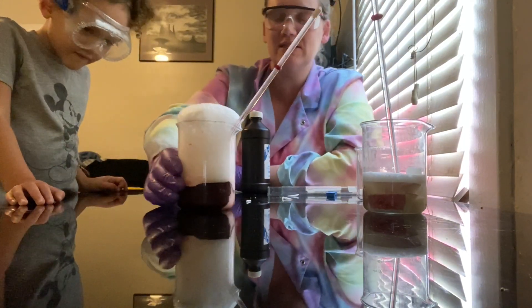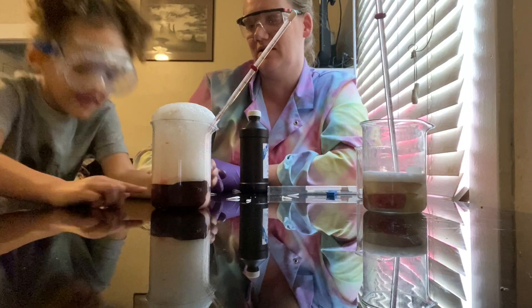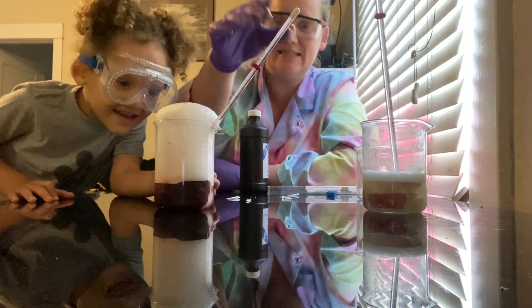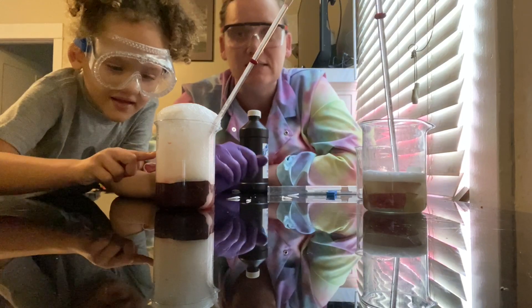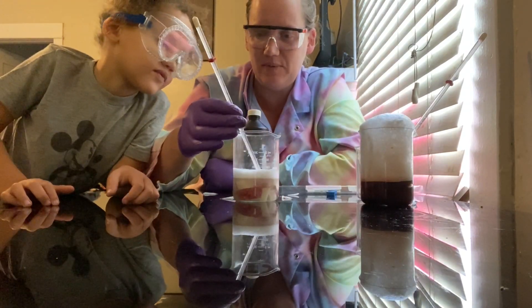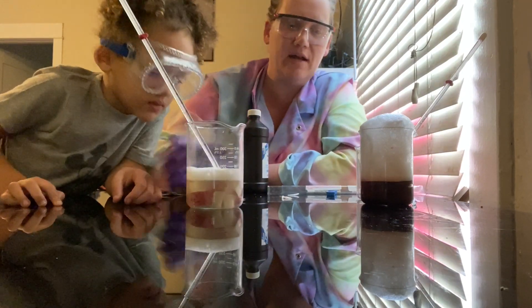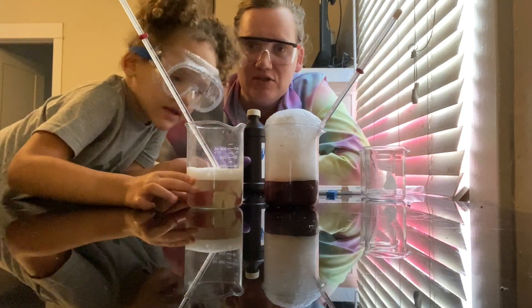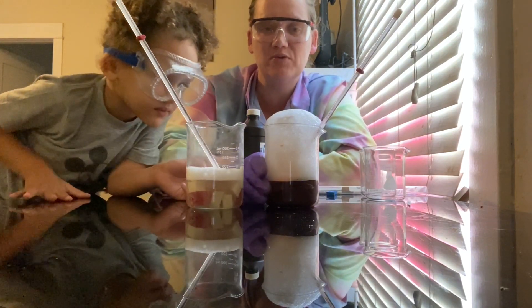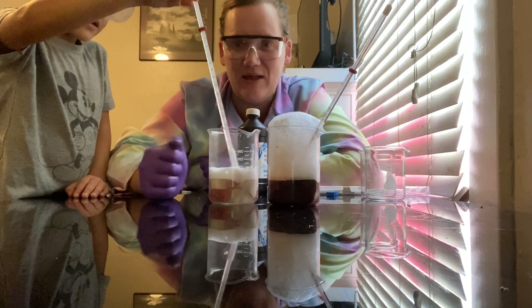Feel the bottom of the beaker — how does it feel? It's hot. So now this is up to about 22 degrees Celsius. It is an exothermic reaction, meaning it releases energy. The potato beaker is up to 21 degrees — it only went up about a degree, and the reaction was not as dramatic. Touching it isn't always the best way to find the temperature; the best way is to use the thermometer. That's why we measure it.